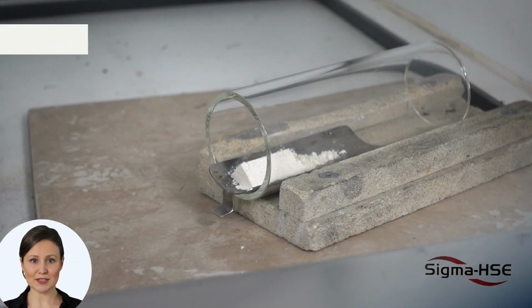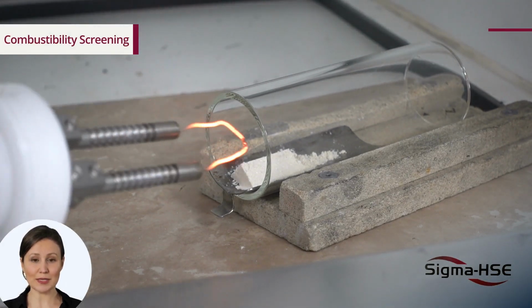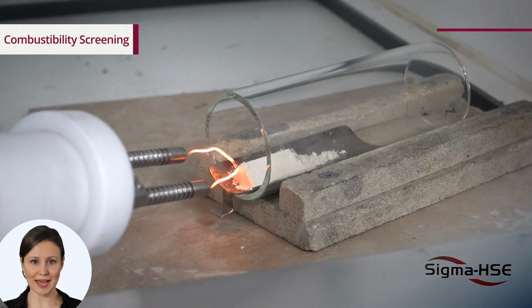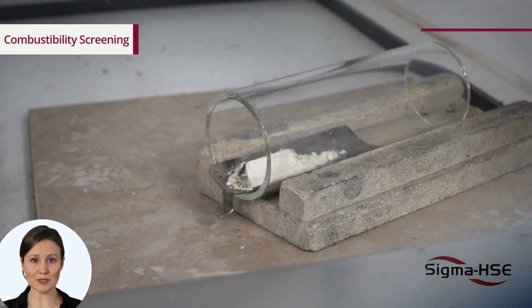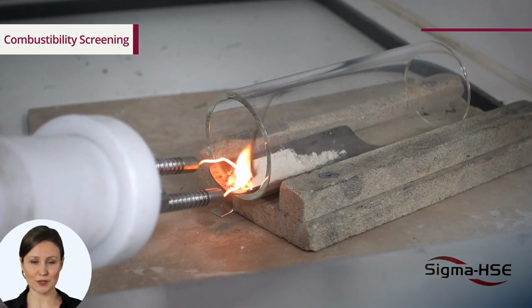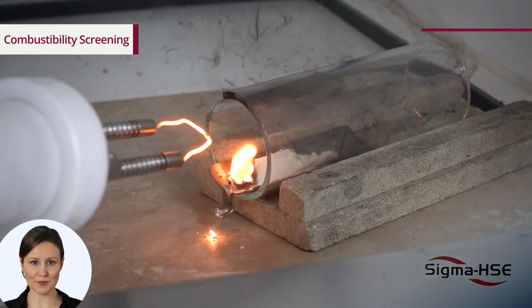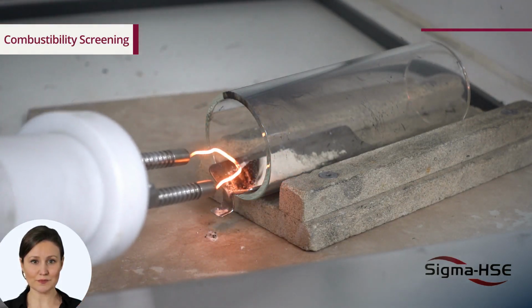This combustible dust test is conducted to assess the behavior or severity of combustion propagation through a material deposit when ignited by an external ignition source. A small powder strip is formed onto a heat-resistant, non-porous plate, and ignition trials are performed using a hot 1000 degrees Celsius platinum wire. This test is used to determine if a powder is combustible in a layer form.